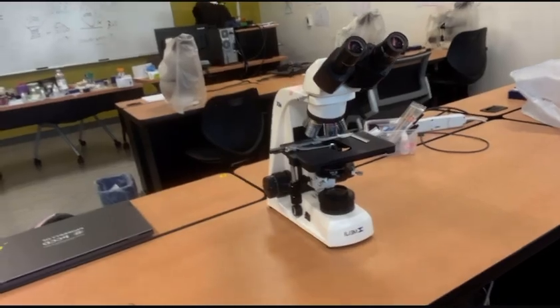Good evening, everyone. Today I'm going to be talking about working distance. And for today, we're going to be using a Meiji microscope to help demonstrate. Also going to be looking at how it impacts refractive index.